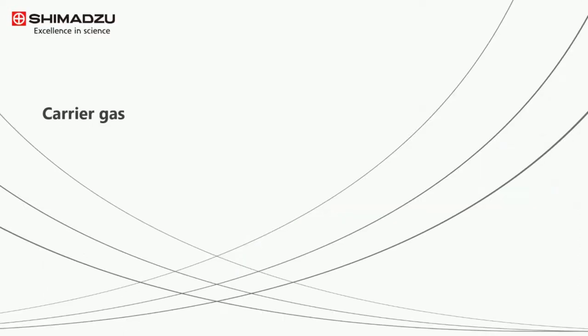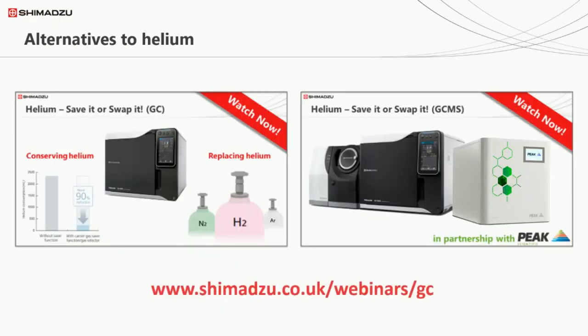Now we should consider carrier gas and the various options available. If you're trying to decide which gas to select, it's worth remembering that helium has been the go-to for a long time. But with increasing prices and supply issues, people are more seriously considering alternatives. If you'd like to find out more, check out our Helium Save It or Swap It series on our website after this webinar.